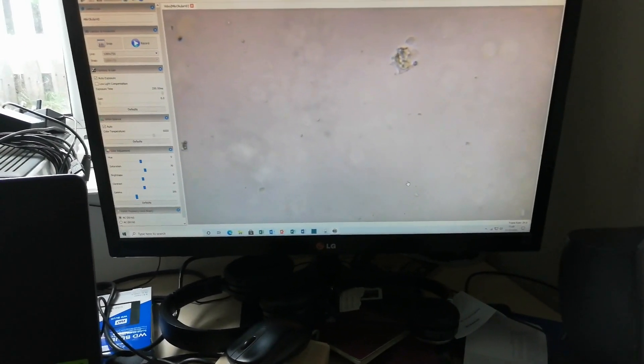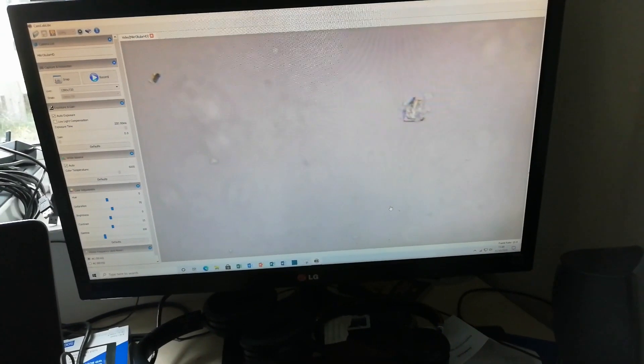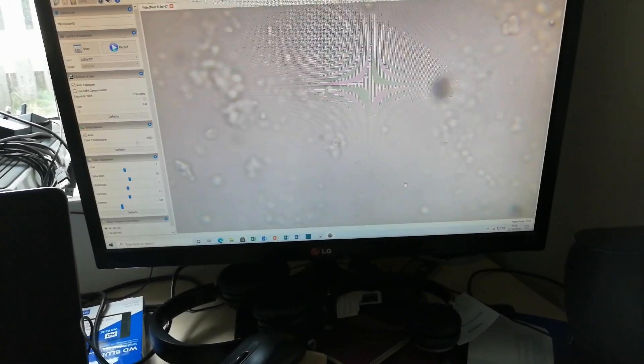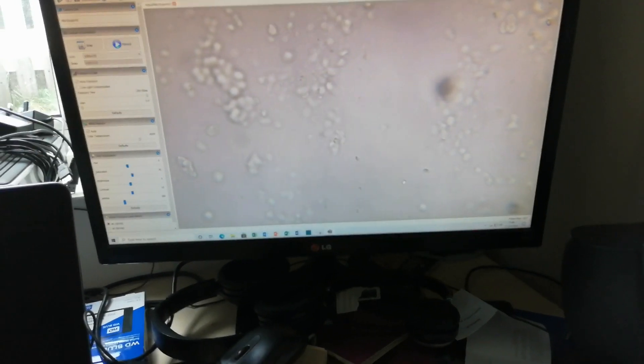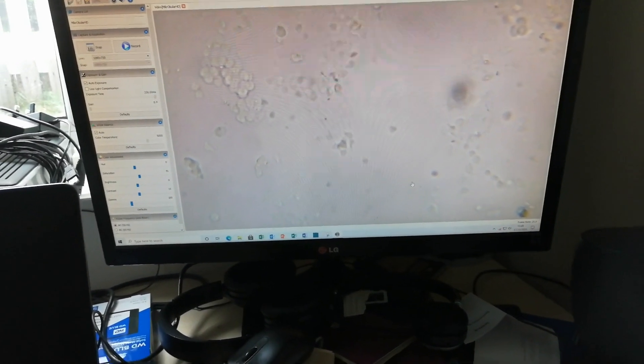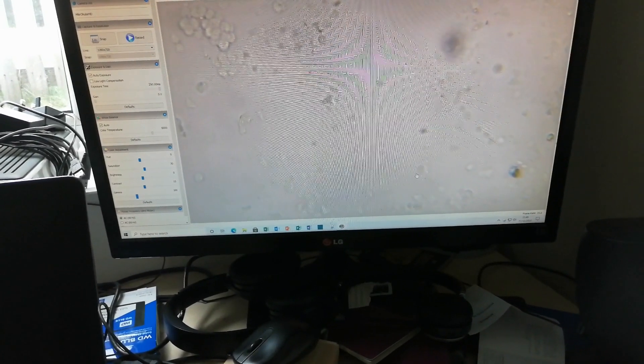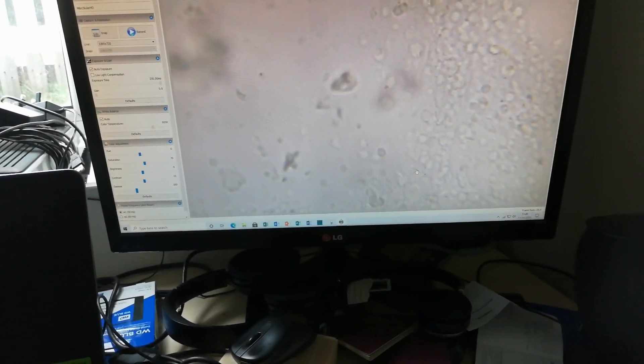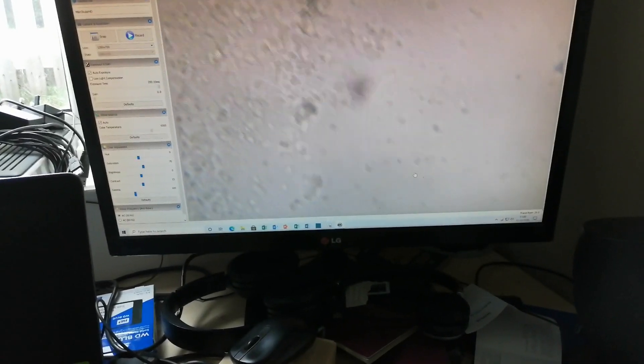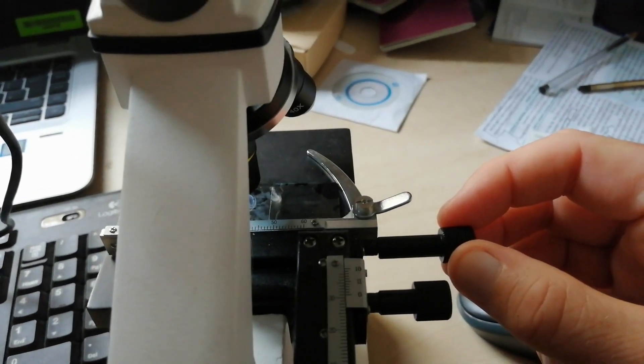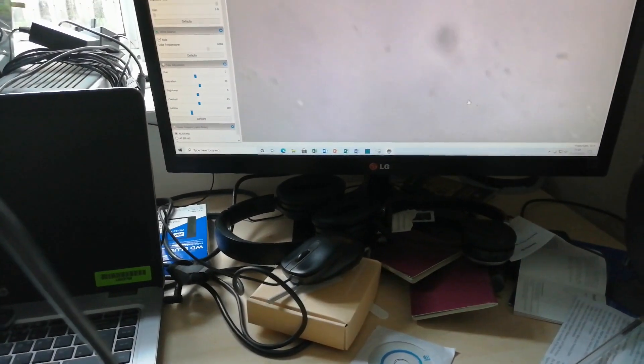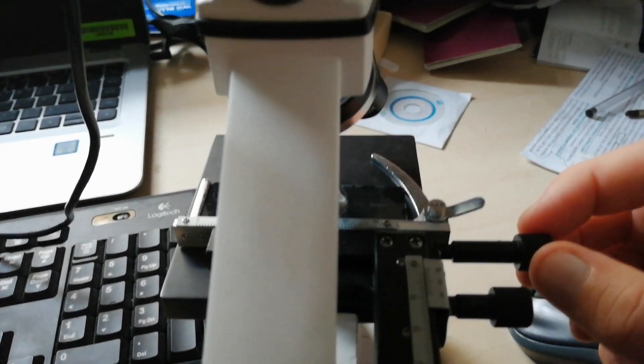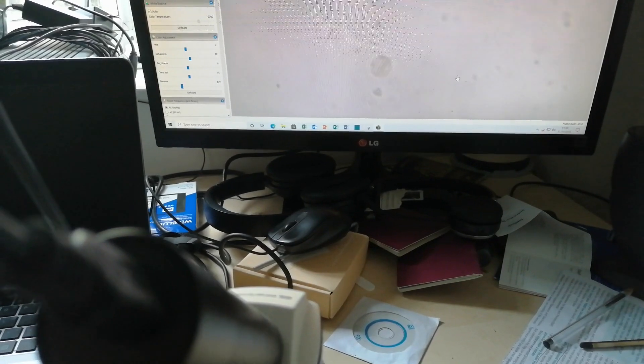Yeah so there's a bit of dust or some particle on top of the lens, and then as I move the slide closer you see what's between the two pieces of glass, which is clearly where we need to concentrate. So I'm going across, looking for movement, just small twists. It's kind of back and forth, up and down.